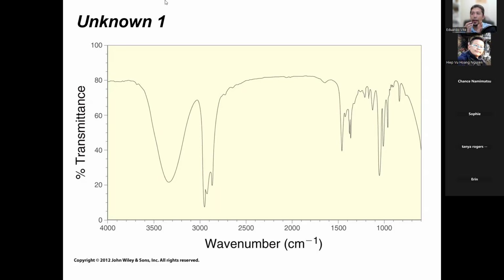Do you see how the alcohol peak looks different than the NH peak? You see how it's a lot stronger and a lot broader, and it's almost more smooth. Somebody described it as blunt earlier, right? And so this is why, the more problems we do, the more you start saying, oh yeah, of course that's this one, of course that's this one, right? So by now you should start seeing that the OH is usually very smooth, it's broad, it's usually between like 3200 and 3500 only, right?